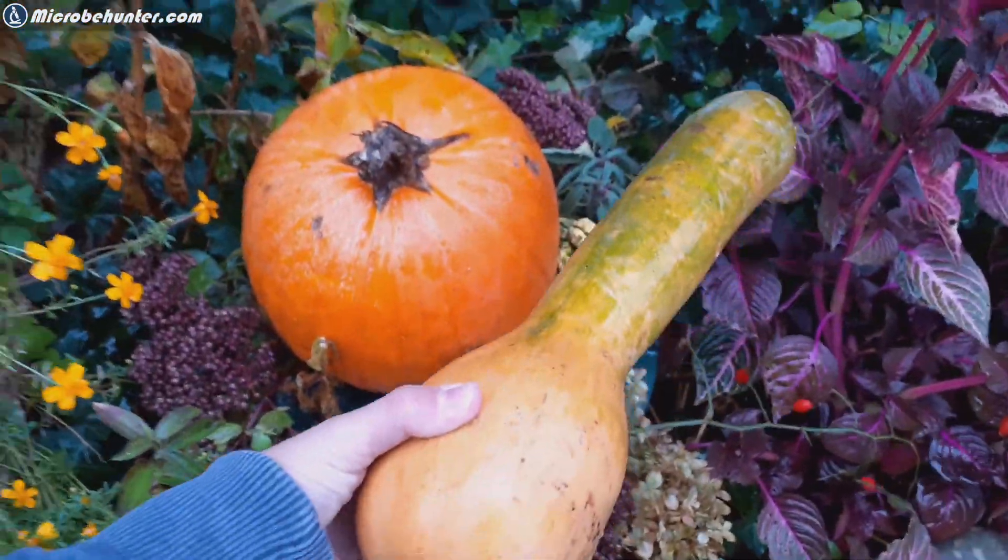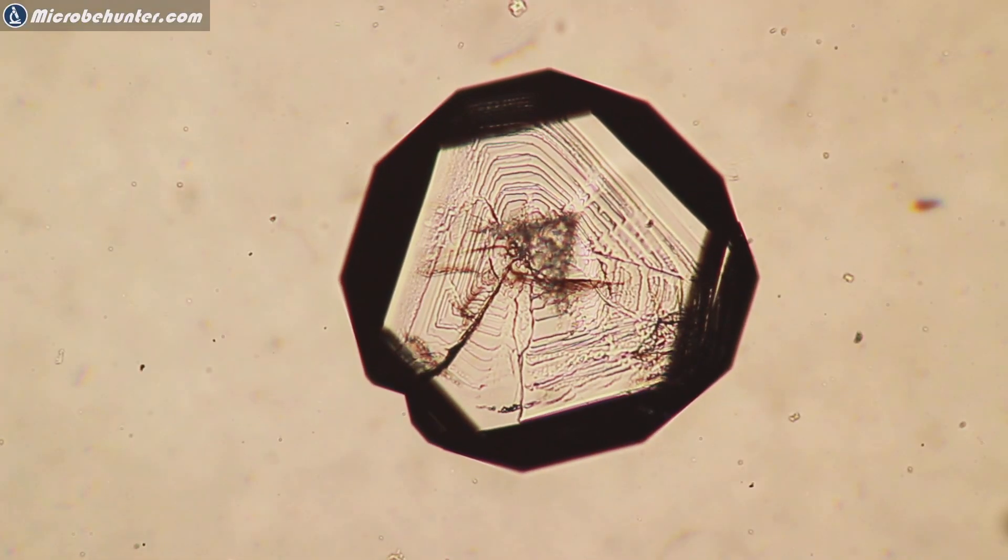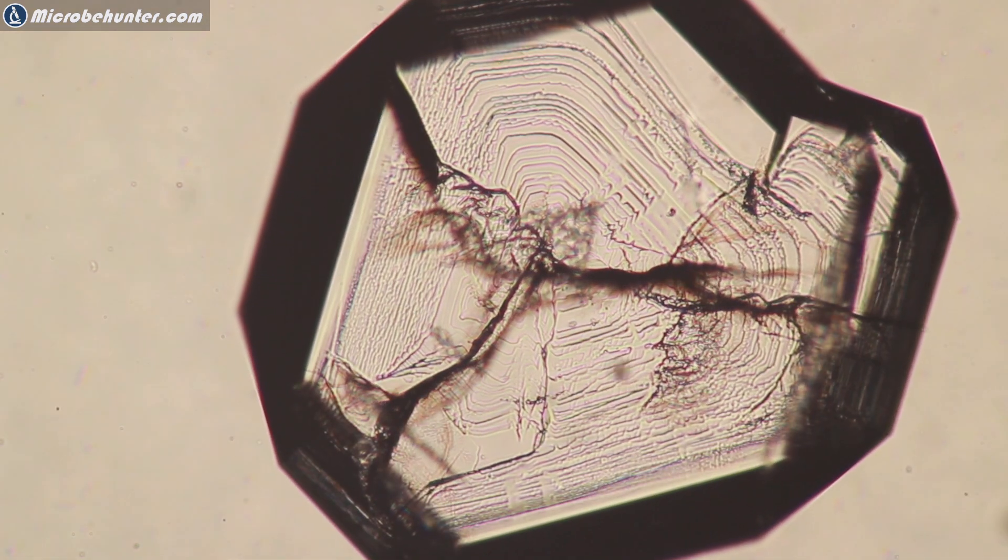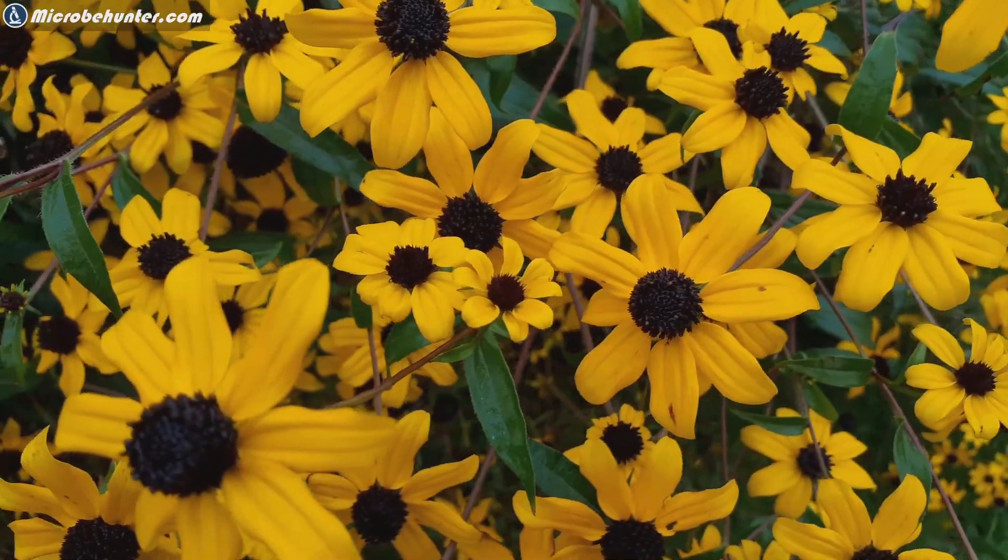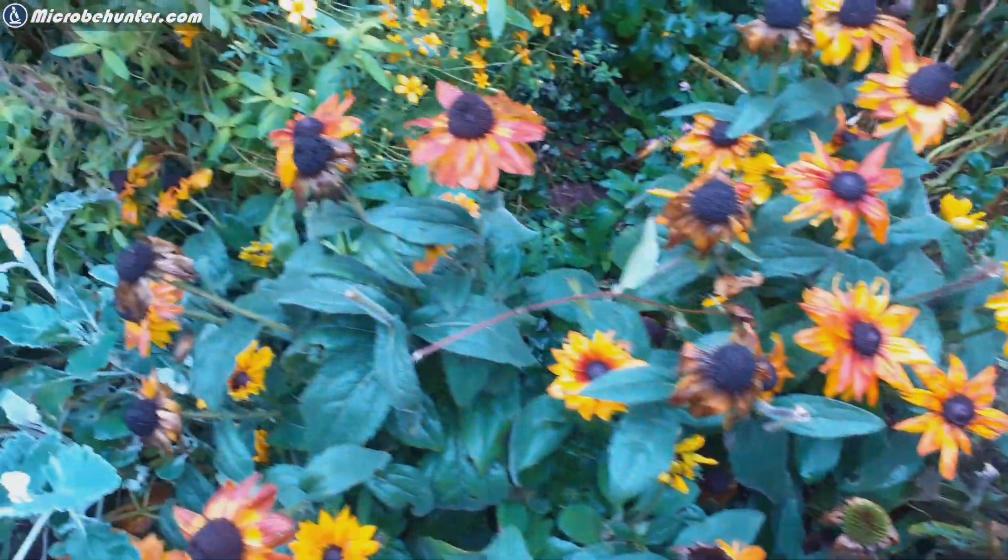I already finished a video showing you growing crystals of aluminum potassium sulfate. I was almost ready to upload it, and then I decided there are more interesting specimens around. So I decided not to upload it, and now I'm here again in the park in the local town where I live, looking for a water sample.